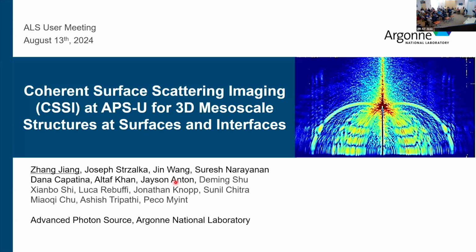I'm basically responsible for the exotic technique called coherent surface scattering imaging. You probably never heard of this. Some of you probably have, but this is a recently developed technique. And this work was not done at the APS-U, it's before. A lot of people contributed to this project, and this is the incomplete list of all the people, with a lot more people over here. And the experience and knowledge we learned before APS-U actually helped us design and construct this new CSSI beamline.